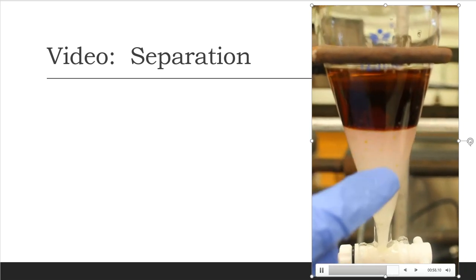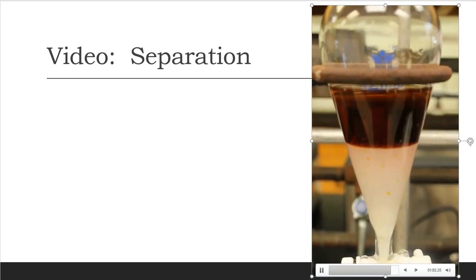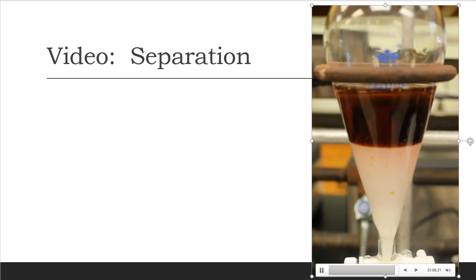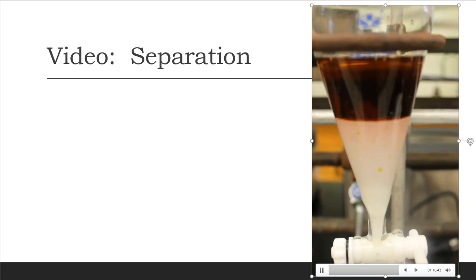So I'm going to drain the aqueous bottom layer off, and then it tells me to give this a couple of washes. And that's what I'm going to do in the next step. So drain the aqueous layer off, and we move on to the next part of the procedure.